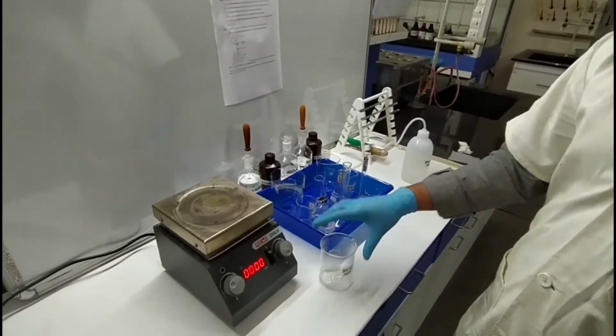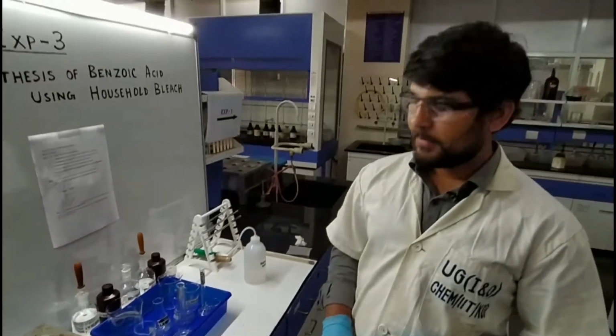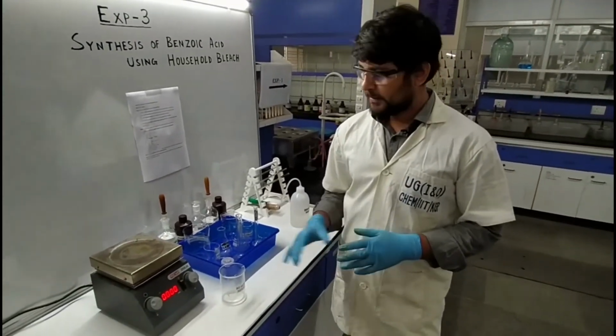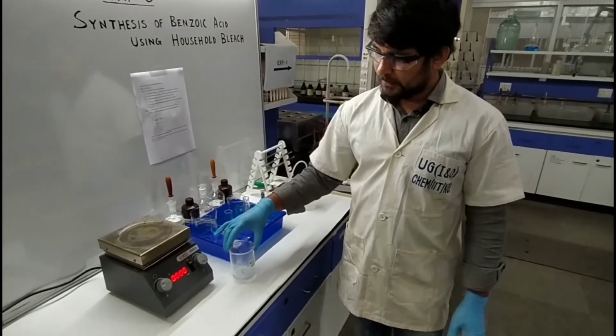Now we have to wait 10 minutes for cooling, to reach normal temperature.